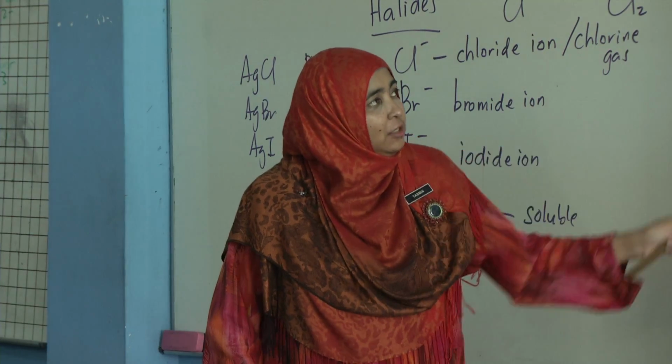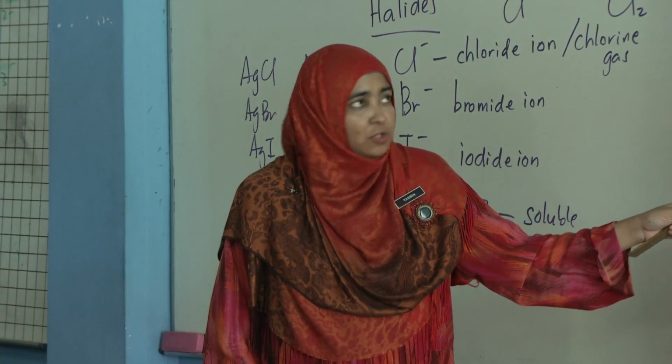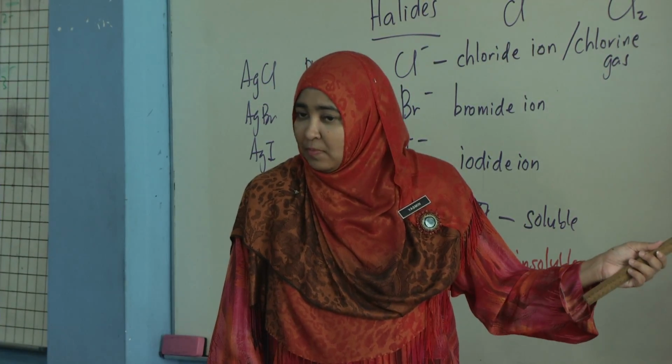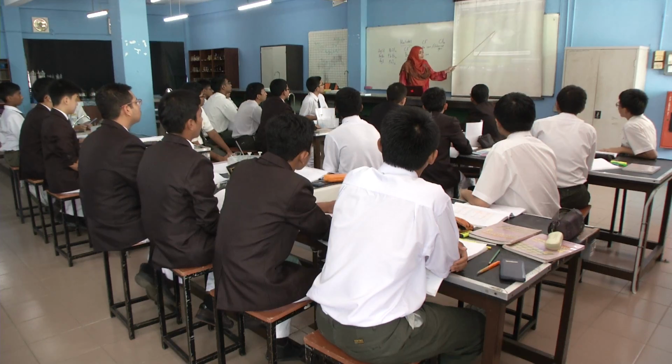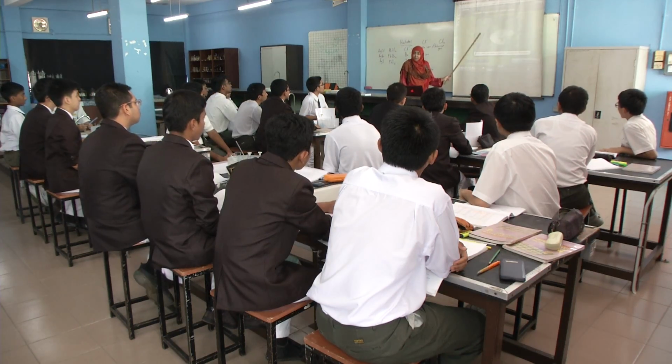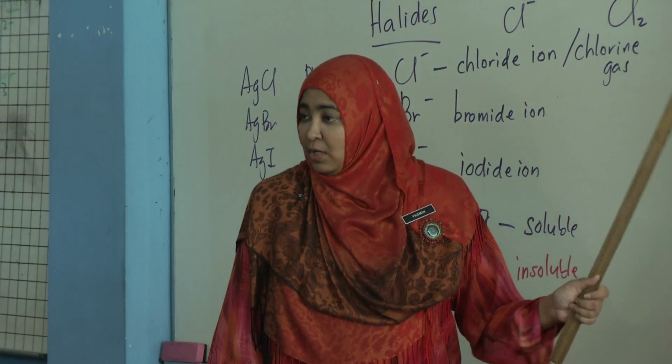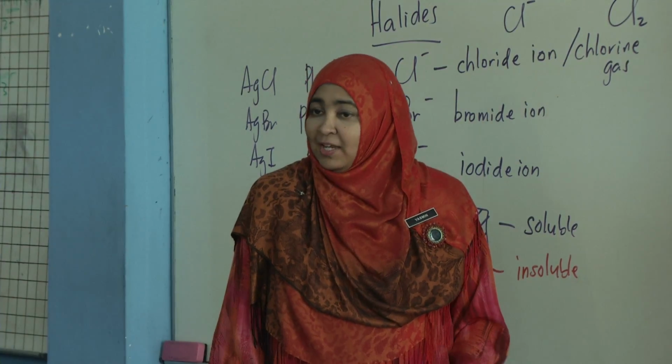Now you're using it to avoid spillage, because we don't want the salt solution to spill out from the filter funnel. Okay, until here clear? Yes. Okay, good. Now we have to leave it for gravity to do its job. So this is the next process, which we will do in your next class. Okay, any questions so far?